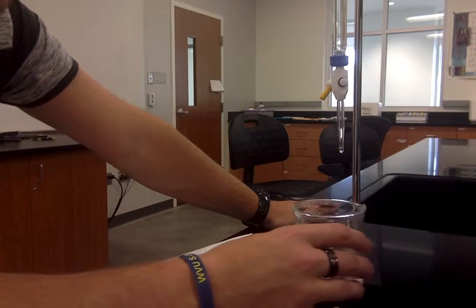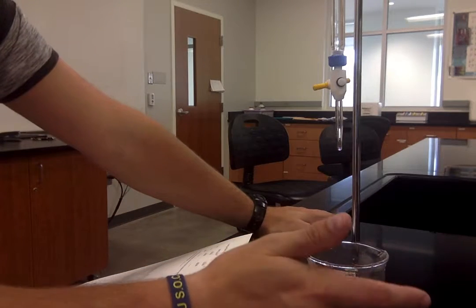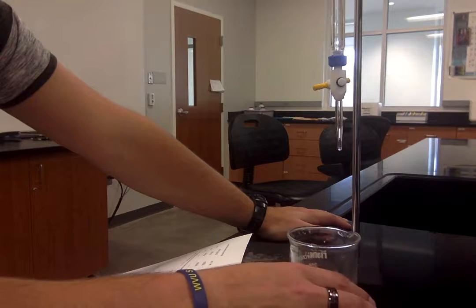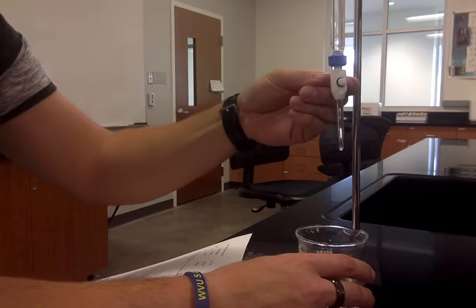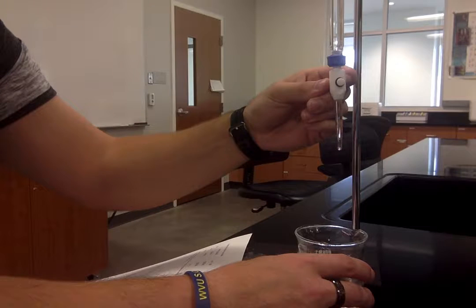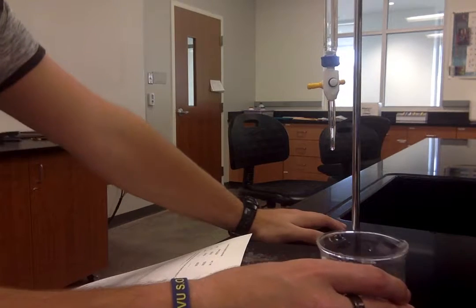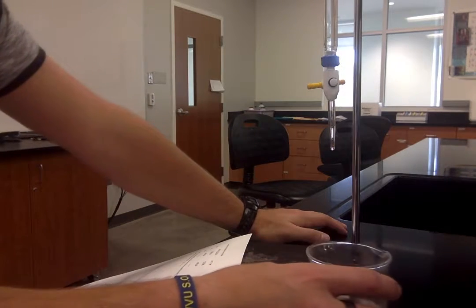Swirl it and if you see pink that starts to stay, turn it off, swirl it around, and if the pink stays and doesn't go away then you know you've reached your endpoint. If it doesn't stay, do one singular drop, then swirl it around — if the pink stays then you're done. If not, do one more drop until you've reached it. It's very much like Avogadro's number where you're looking for that singular drop on top of that monolayer — same principle.